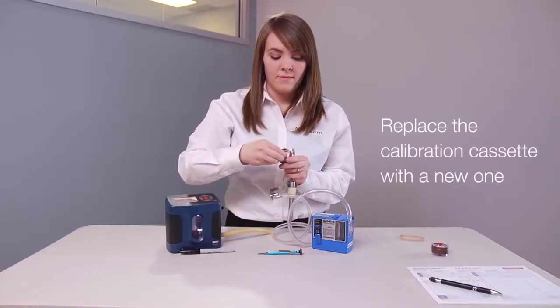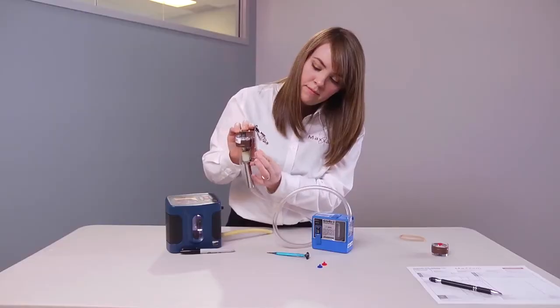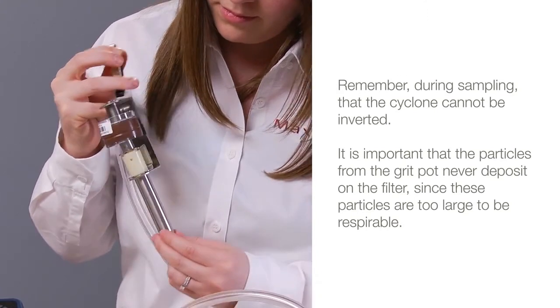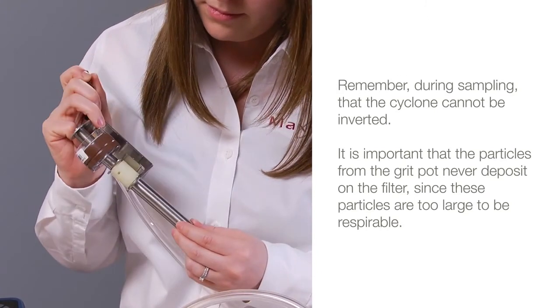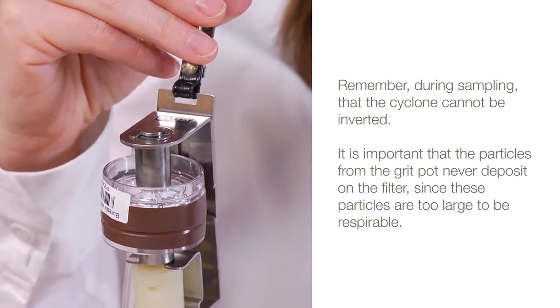Replace the calibration cassette with a new one and now collect the sample. Remember, during sampling, the cyclone cannot be inverted. It is important that the particles from the grit pot never deposit on the filter, since these particles are too large to be respirable.